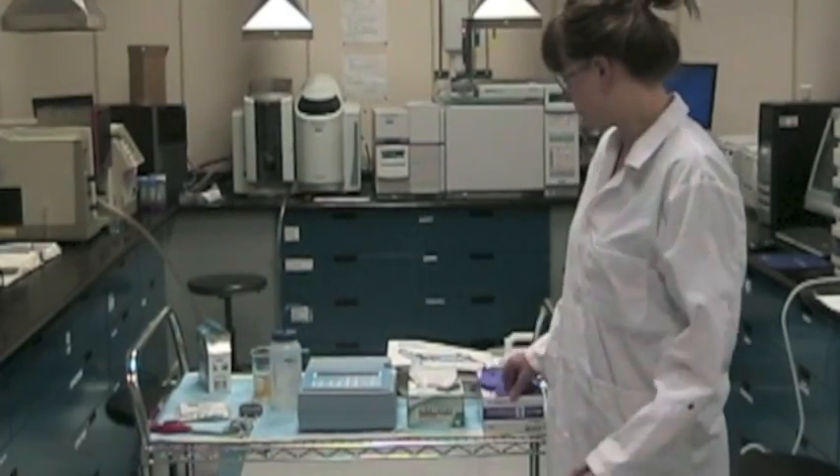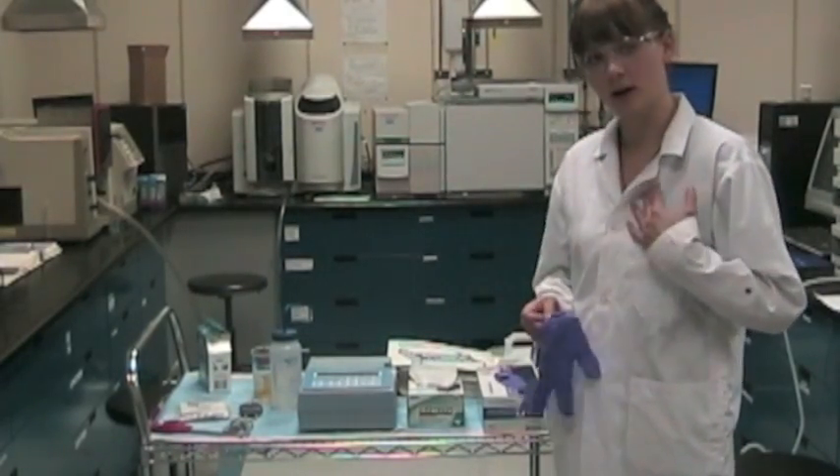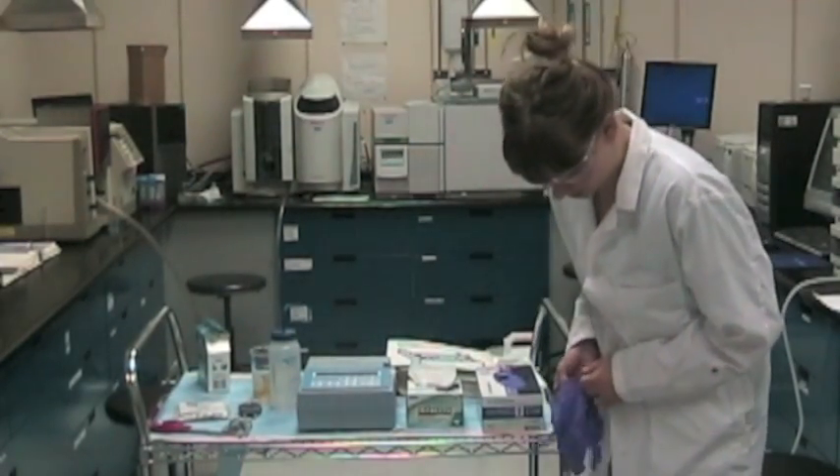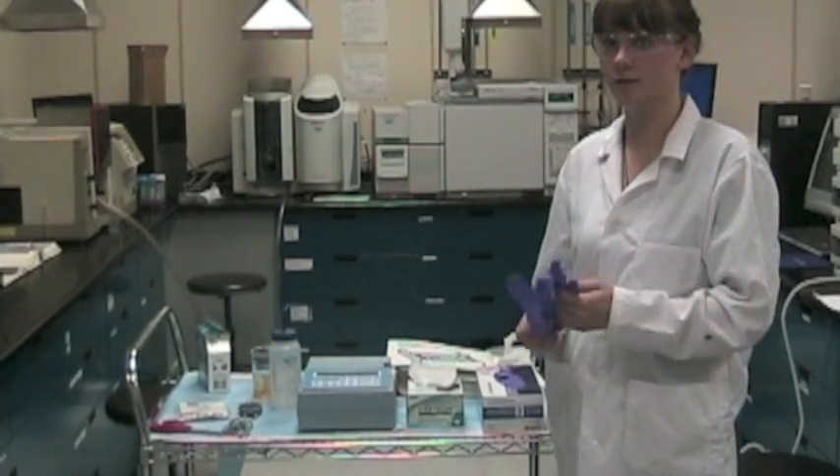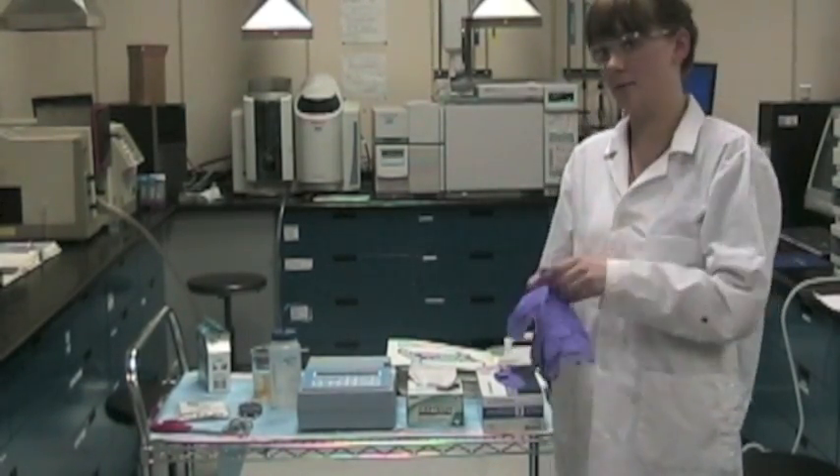Ensure proper quality assurance and quality control, as well as following safety in the lab. For lab safety, it's important to wear proper gloves, a lab coat, close-toed shoes, eye protection, and if you have long hair or a mullet, to tie it back.